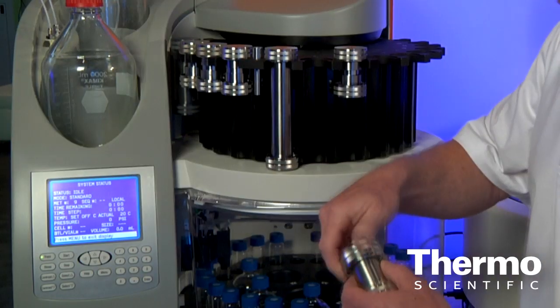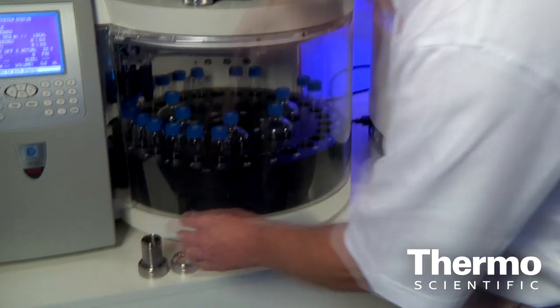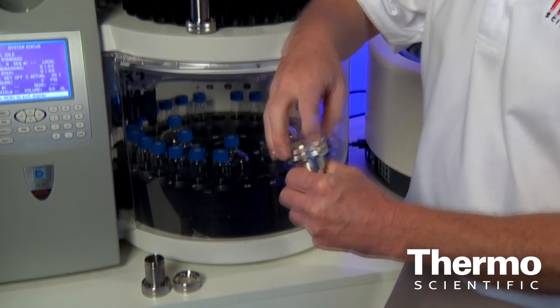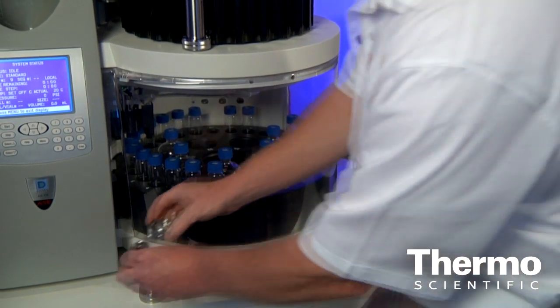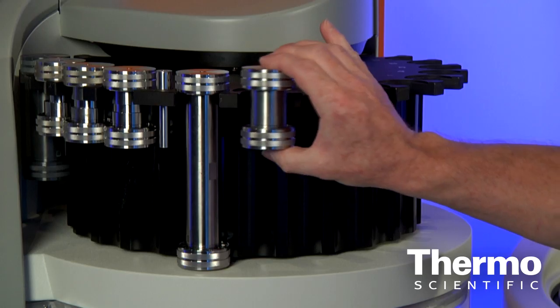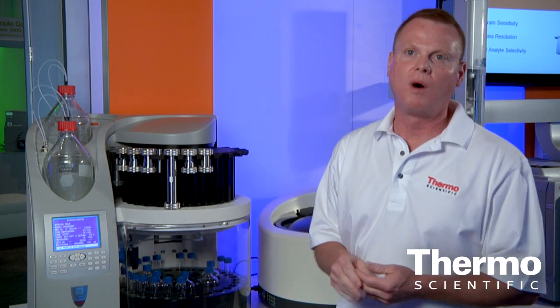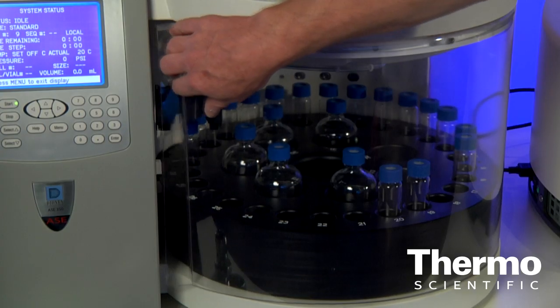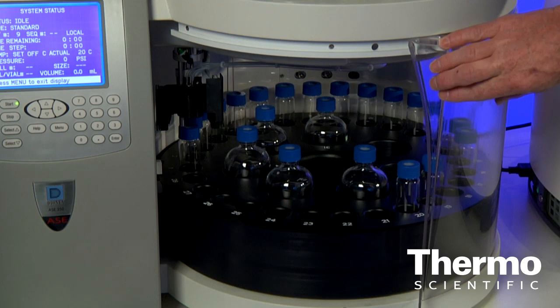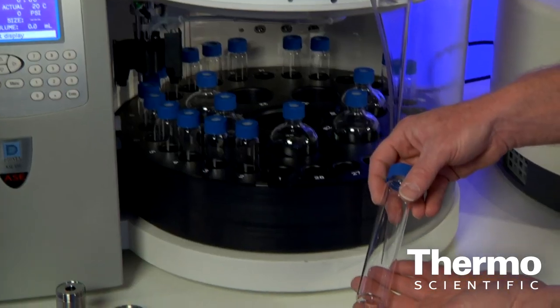The samples are loaded inside a stainless steel extraction cell. We have many different sizes available to suit the needs of different sample types and different extraction methods. They're reassembled, placed on the autosampler carousel, you push the start button and walk away. The instrument will automatically extract the samples and the extracts are deposited on the lower carousel in either 250 ml collection bottles or in a 60 or 40 ml VOA type vial.